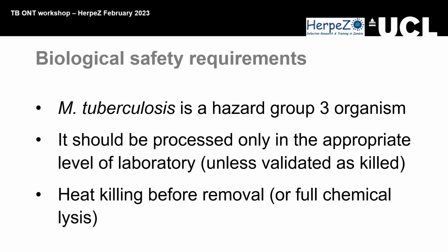In some labs, certainly in the UK, our lab has validated that 80 degrees for 20 or 30 minutes isn't enough to guarantee that you killed all of the bacteria. So we would recommend 95 degrees, but the trouble is that the higher the heat, the more likely you are to start denaturing the DNA.